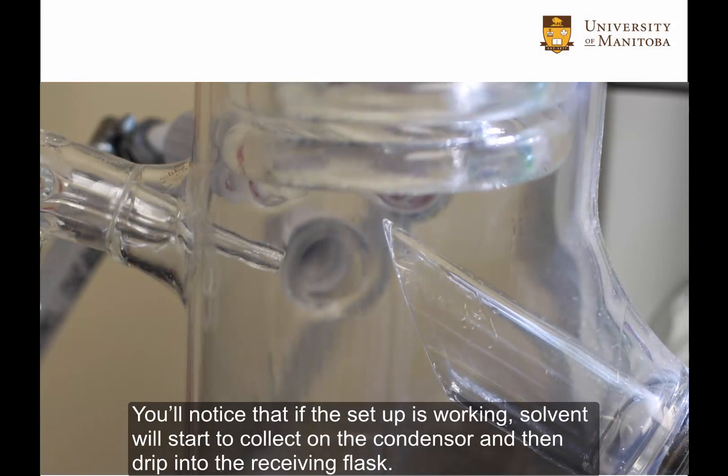You'll notice that if the setup is working, solvent will start to collect on the condenser and then drip into the receiving flask.